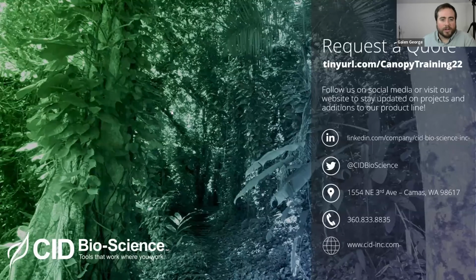Okay, the next question is, thank you for the presentation. You mentioned the zenith angle is automatically calculated based on time of day and GPS coordinates. I was wondering if the precision of the GPS sensor in the instrument is high enough. Some GPS sensors give readings several miles from the true point. No, so our GPS sensor is very highly accurate, but if you are concerned about its accuracy, you can always reference it against another GPS that you are using.